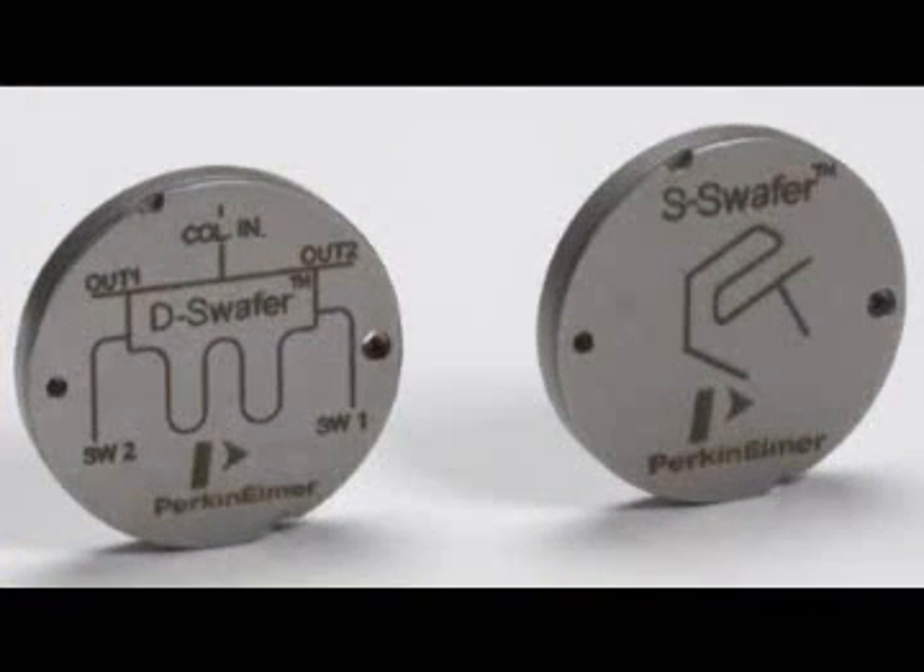That is the D-Swafer. With it, we can do heart cutting, we can do column switching, and we can do injector switching.